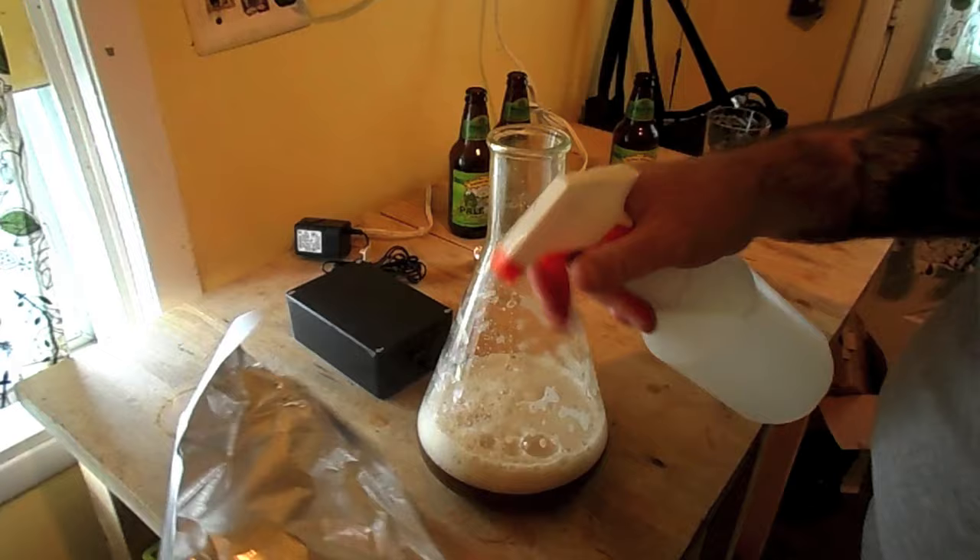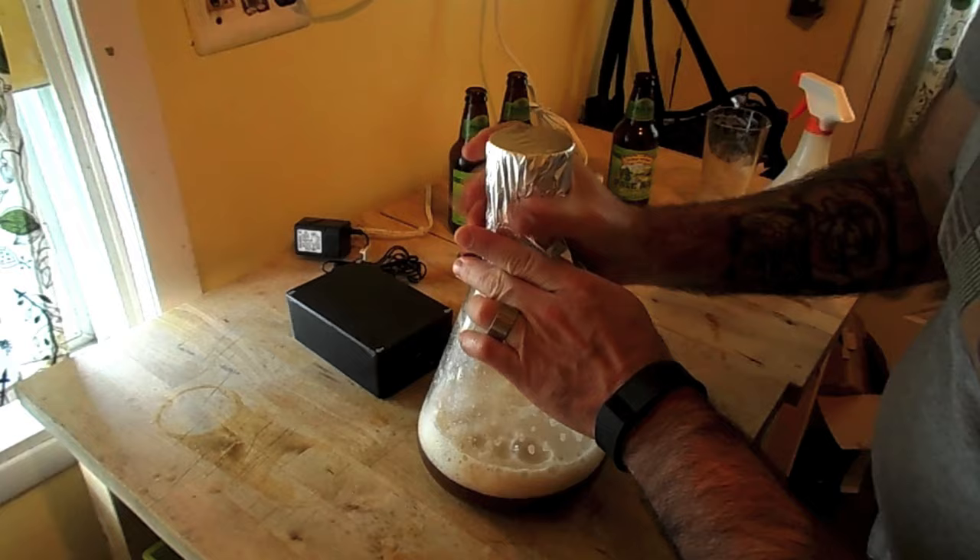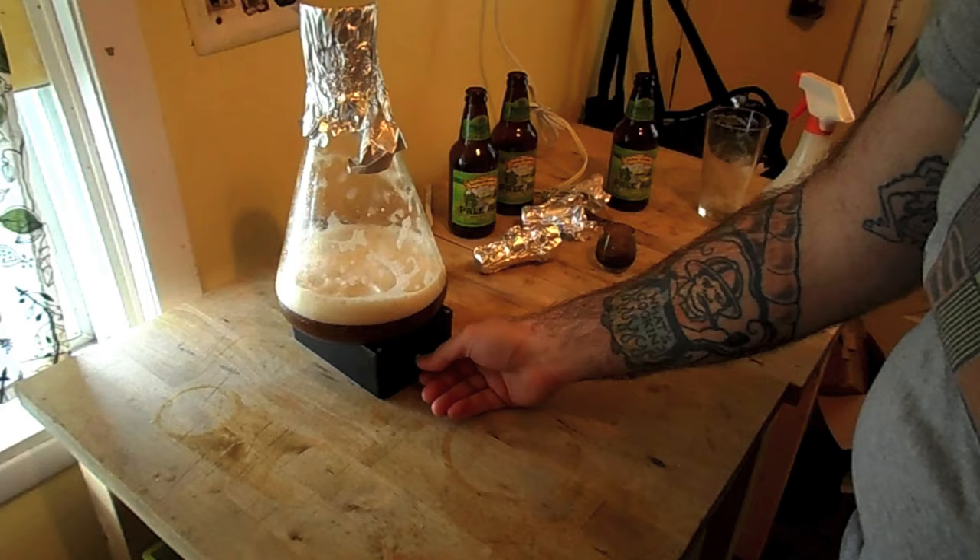I'm going to put my stir bar on the tin foil here, then just pop it on my stir plate and have at it. We'll see what happens in a short period of time.